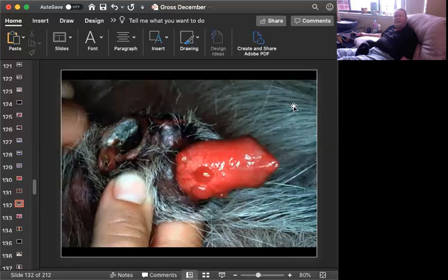Okay, slide number 8 is tissue from a dog, and a great advertisement for wearing gloves. Okay, time's up. Now, this person wasn't wearing gloves. That's okay. Might want to clean his or her fingernails too. That's okay too. And he's not going to catch this from this dog. But we do tend to wear PPE when we can.